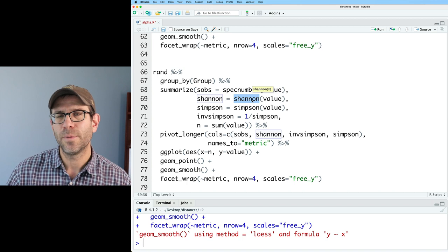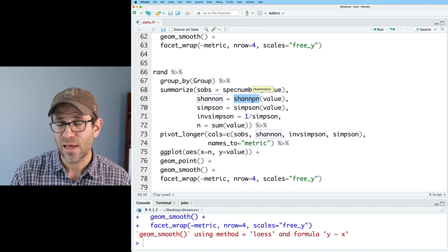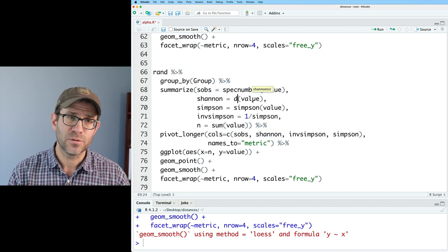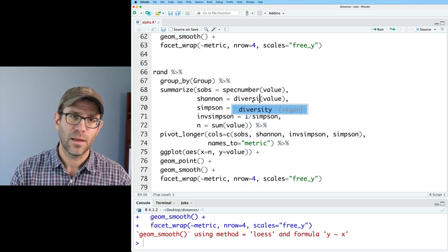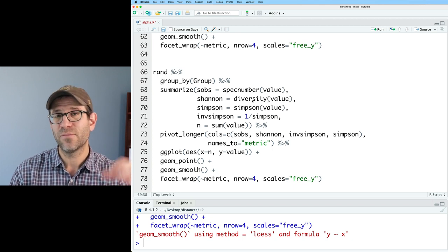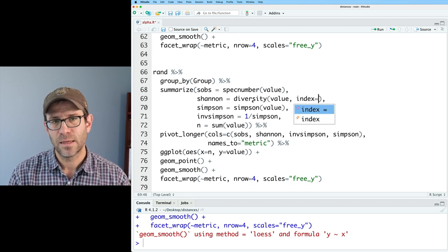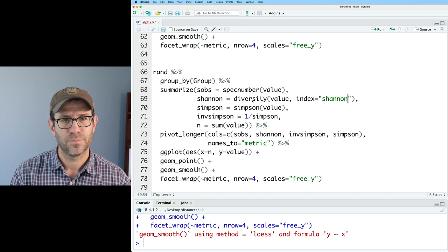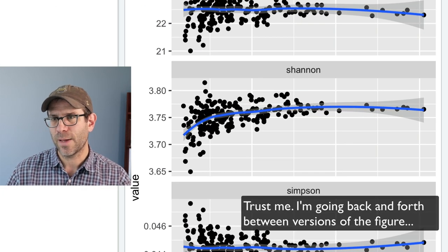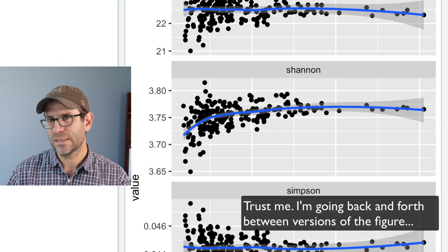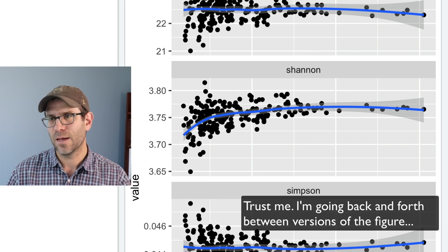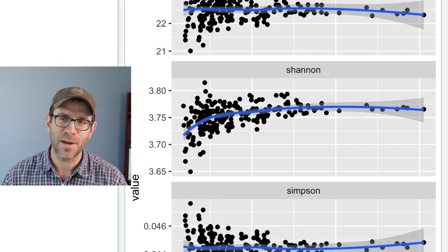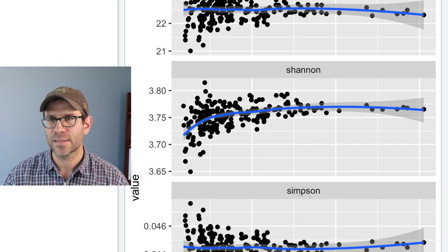Next would be to change out that Shannon value. And so for that we can use diversity as the function and we give it the value and then we give it index and then we can say Shannon. And so now for Shannon, as I toggle back and forth again, I don't see a difference between their implementation and my implementation of the Shannon diversity index.